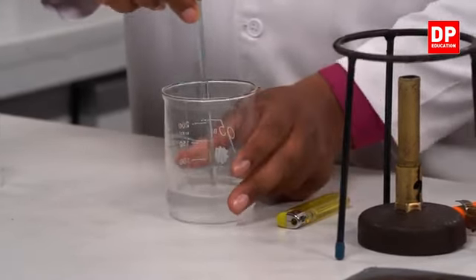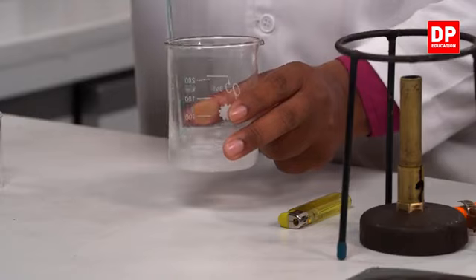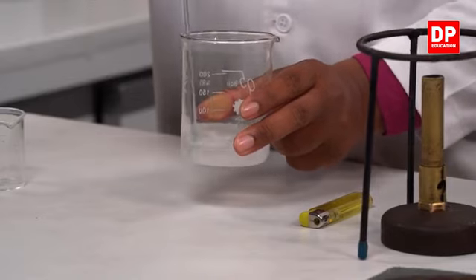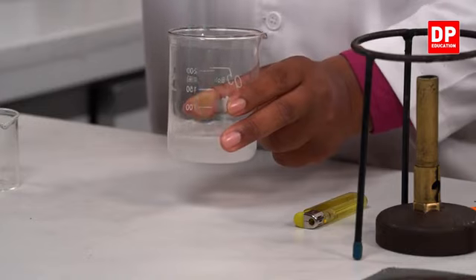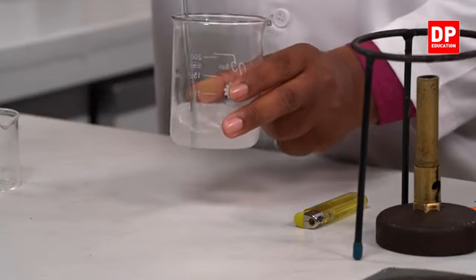So when I'm dissolving salt, gradually the salt crystals will dissolve in water, and the crystalline nature of the salt will totally disappear. Right?